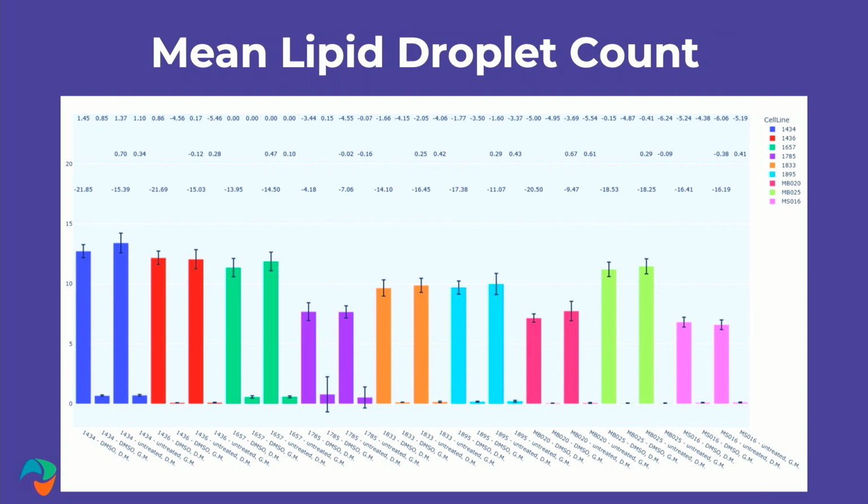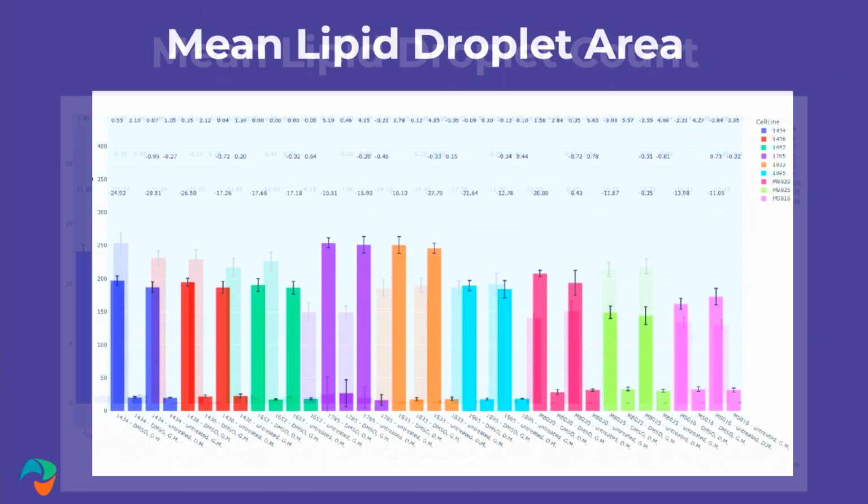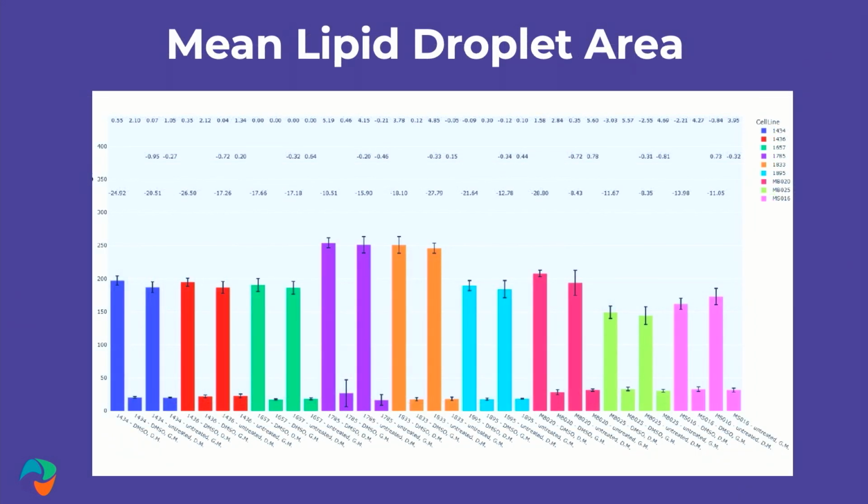How many lipid droplets are there per cell on average? All I want to get from this slide is that there's no significant difference between the patients, maybe a little differences, but the lipedema adipocytes seem to have the same amount of droplets as the obese or the lean control ones. And this mean droplet area is the same as well. So the difference here is not in the amount of adiposity per cell.